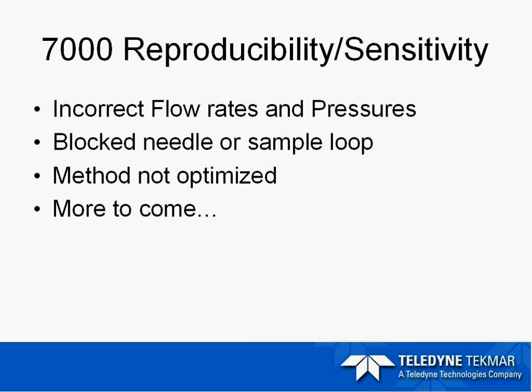Many problems for reproducibility and sensitivity on the 7000 can be resolved by checking the flow rates, pressures, and checking the system for leaks. Sometimes it can be a problem with a heated zone, so it is important to go through the self-test as well as checking our standby flow rate, our static vial pressure, and our vial pressurization. A blockage in the needle or sample loop can also cause reproducibility problems — sometimes the butyl rubber septa can cause blockages in the sample needle. You can use methanol to flush the needle out or sonicate it. Also check whether your method is optimized for temperature settings and equilibration time.